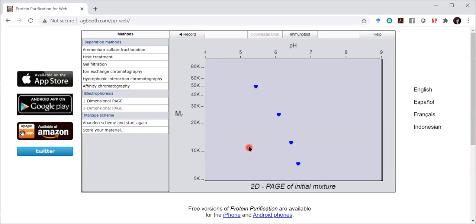There's a great video in the exercise that you'll get to a little later that talks about how these things are run. But the short answer is you get information about your protein's PI and its molecular weight. So since we're separating based on two properties here, we can get more information, and we can sometimes take two proteins that might be the same in terms of size and get different results here.